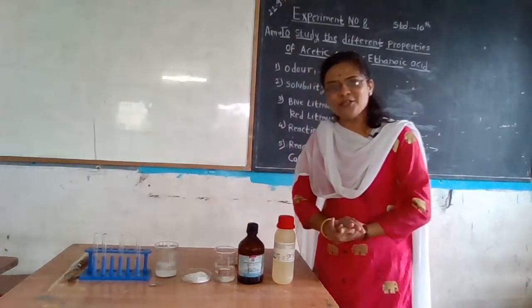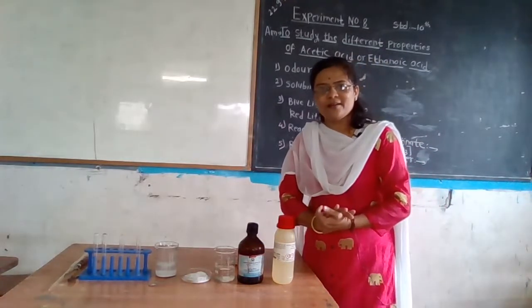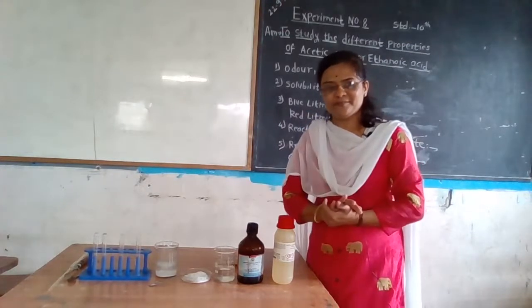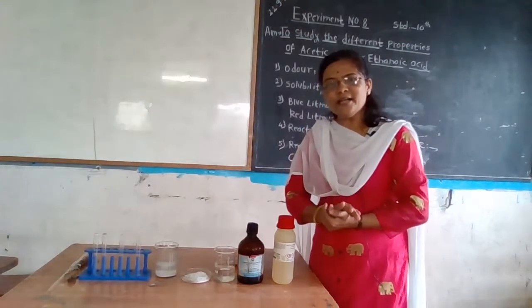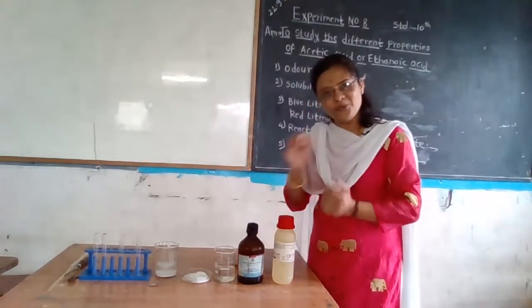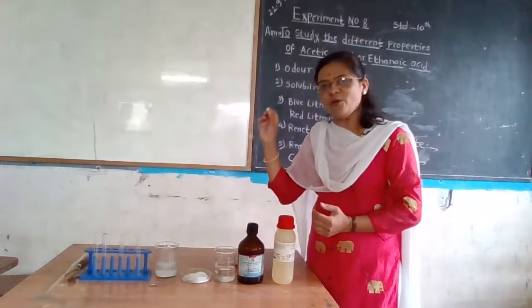Today we are going to start the practical demonstration of properties of acetic acid. Students, what is the molecular formula of acetic acid? You know, CH3COOH.